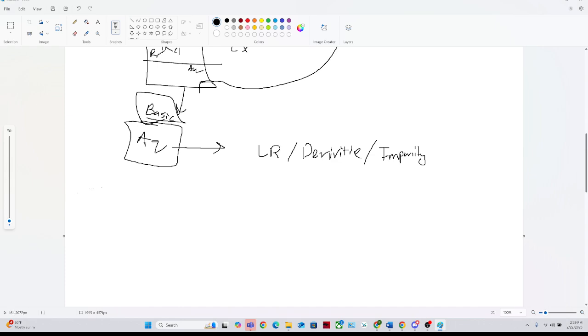And what I'm going to do is acidify to pH 2. This is important because you don't want to go to like pH 5 or pH 6, even though they're acidic. You really want to ensure that all of your carboxylic acid is fully protonated. If I go to pH 4, there's some carboxylic acid that's still deprotonated. So you really want to push it past, but you don't want to go too far.